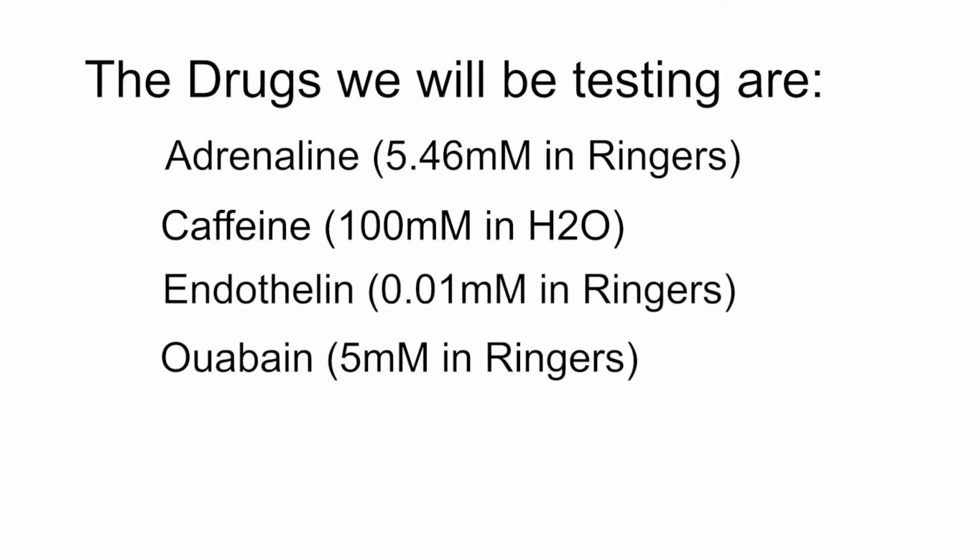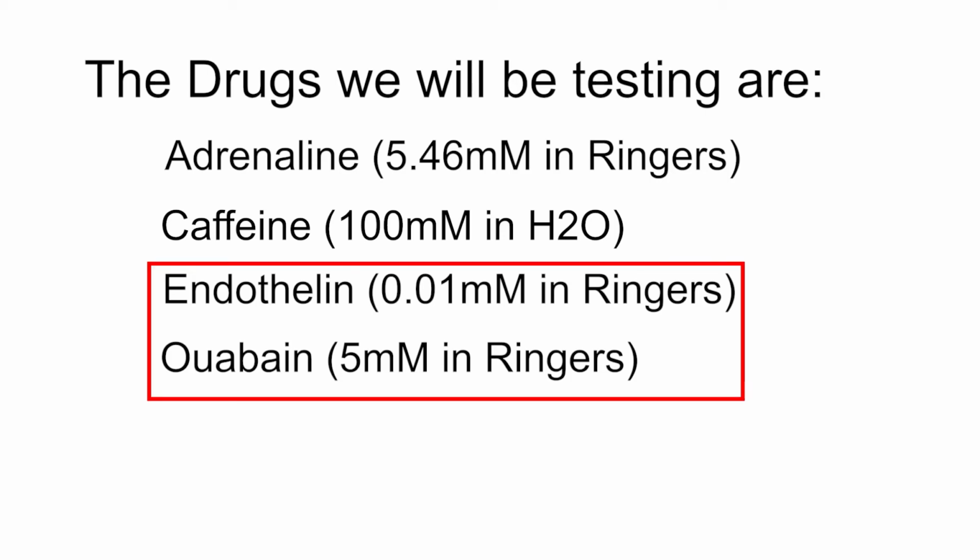Once again, these are the 4 drugs that you've got to choose from. And I think you're starting to get the idea now of how we go about testing each of these treatments. So in the interest of time, we won't go through the remaining 2 drug treatments since they're done in exactly the same way.